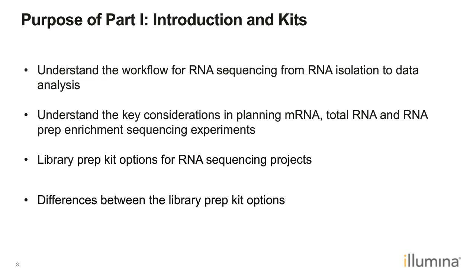The purpose of this introduction is to understand the workflow for RNA sequencing from RNA isolation all the way to data analysis. We also want to understand key considerations in planning mRNA and total RNA sequencing and consider them before we start processing our samples. We will then take some time to focus on kits specifically, and I do want to remind you that part 2 will be focusing on the best practices, while part 3 of this series will dive into the analysis a bit more.